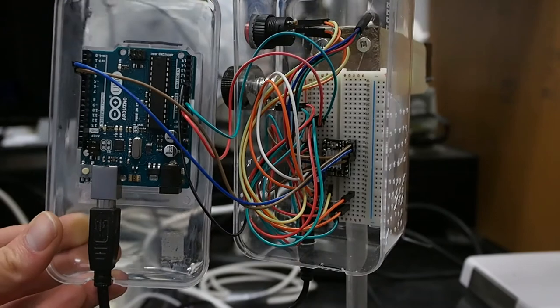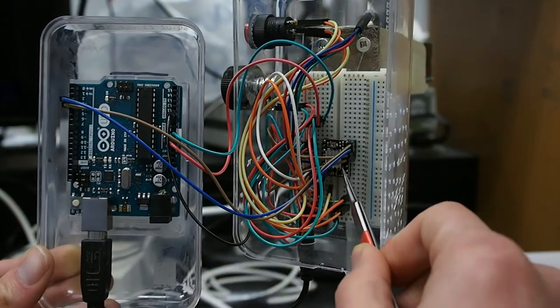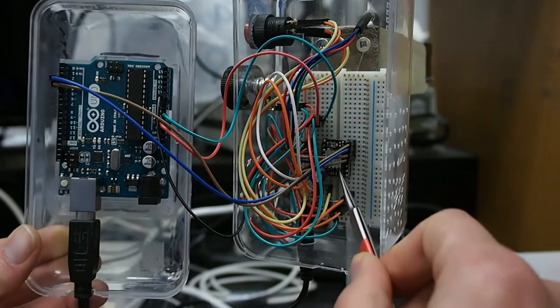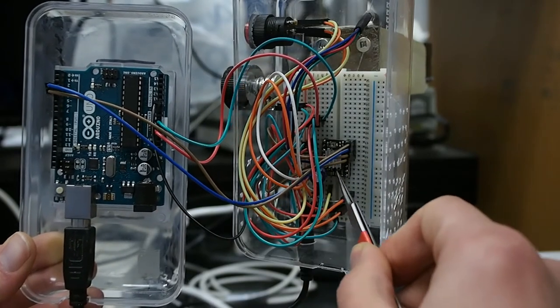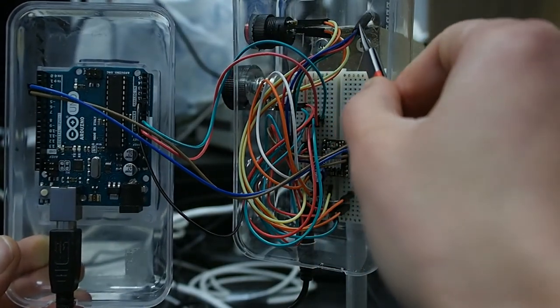So as I've mentioned before, this is the Arduino microcontroller that I have programmed to run the stepper driver, which has a built-in translator for easy operation, allowing us to control the stepper motor with just two pins from our microcontroller.